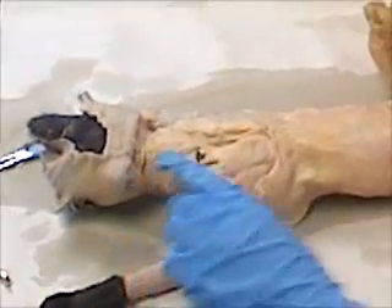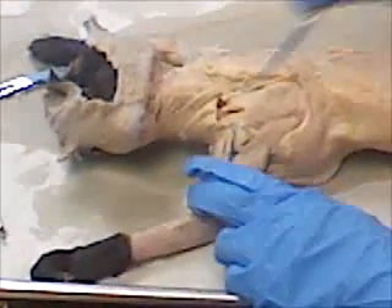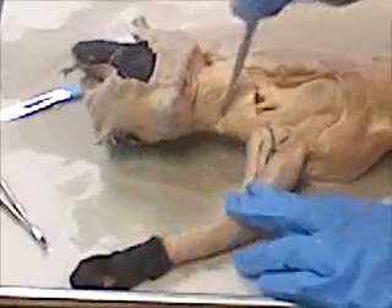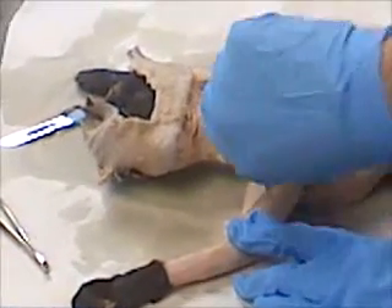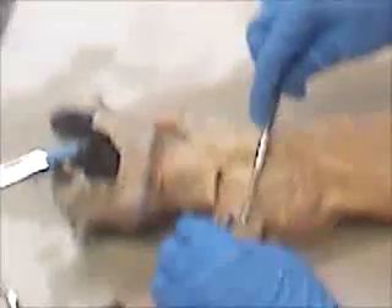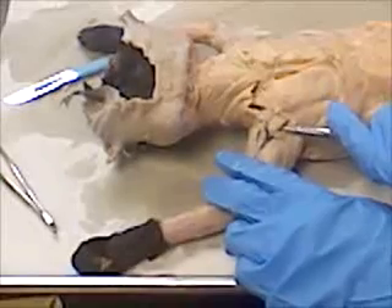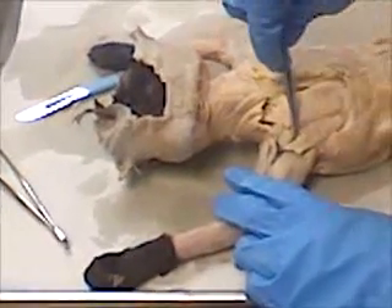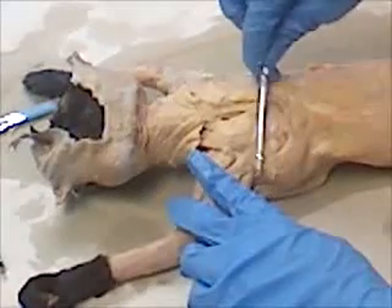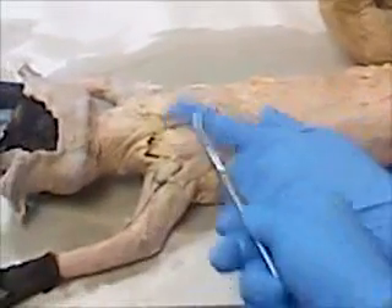Want to go over that again? Yep. This is the clavotrapezius — you go down from the neck to the bicep. This is the clavodeltoid. That's the levator scapulae ventralis. This is the acromio deltoid, this is the spinal deltoid, this is the spinal trapezius — and this is the acromiotrapezius. Kind of makes sense in a way, because it says right there in the spine area.